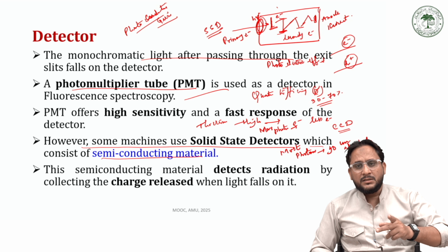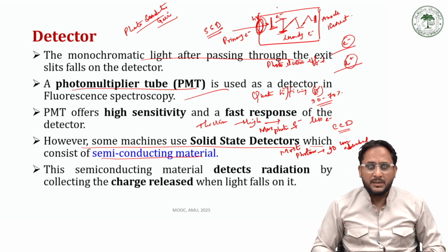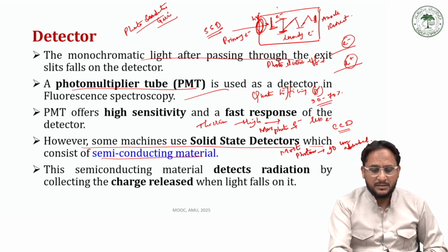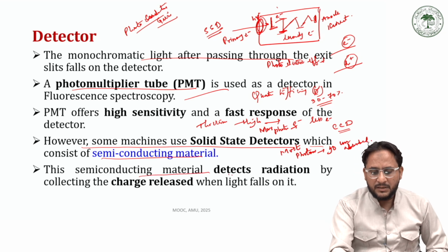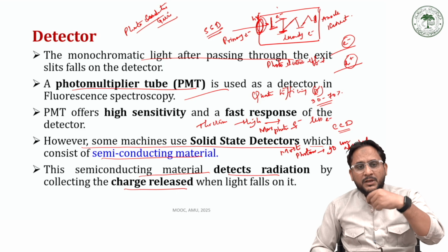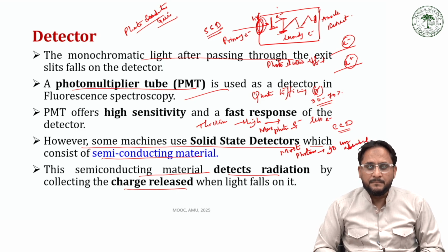These charge carriers, electron and hole pairs, basically create an electrical signal in these devices, and these devices are even useful for the detection of multiple elements at a time.